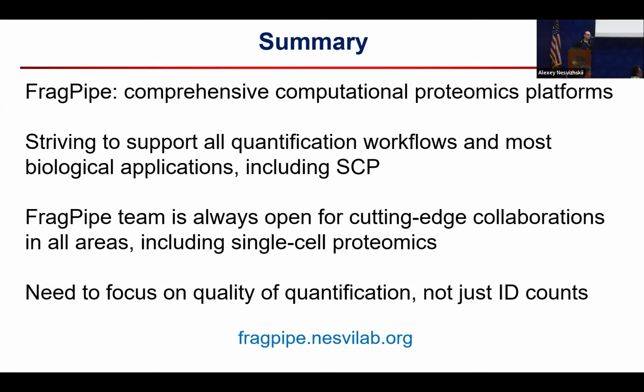Alexey, I think your point about focusing on quantitative accuracy rather than identifications is very resonant with many of us. Certainly, I strongly agree with that. And you discussed the challenges with defining metrics for it. It is very difficult, but I think unless we have metrics, it will be very difficult to shift the focus. Whatever is measurable, people optimize. If something's not measurable, it is difficult to advocate for it.